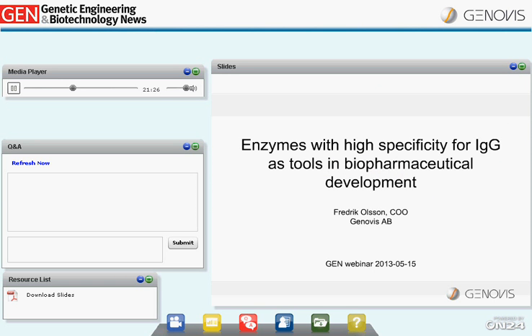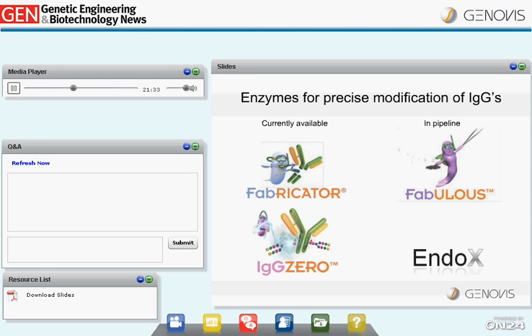Thanks, Emily. So the outline of my talk will start off by covering the Fabricator enzyme, its background, the high specificity for IgGs, best reaction conditions, and different product configurations of the enzyme. I will then describe the endoglycosidase IgG0, which is recombinantly modified, and how this is used in an optimal way.